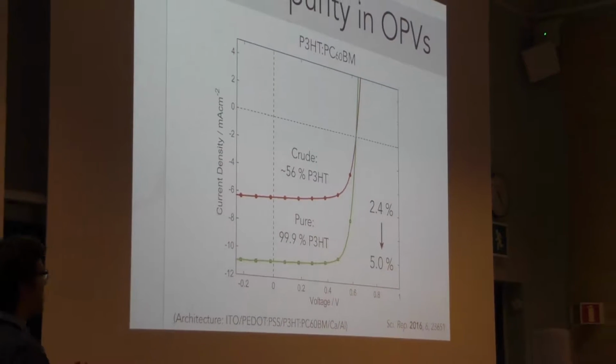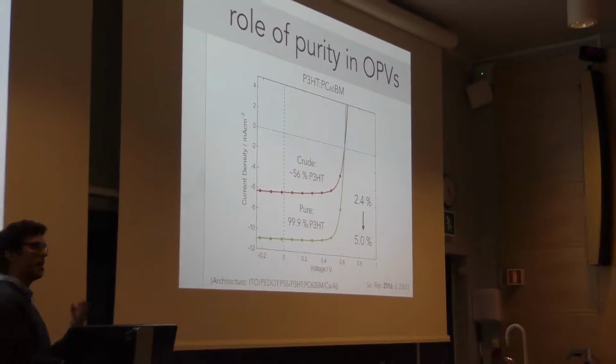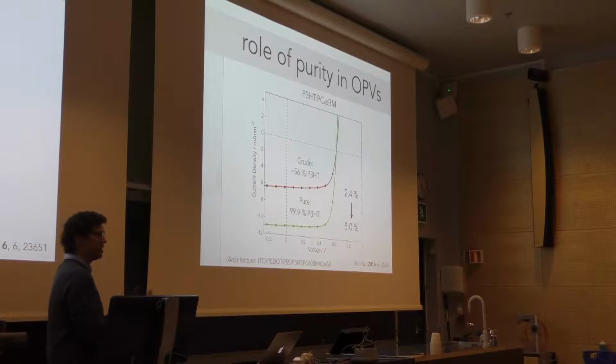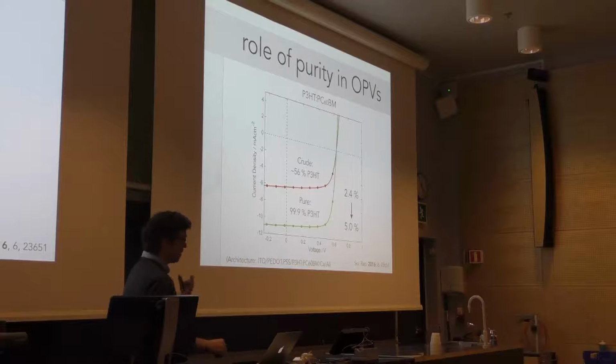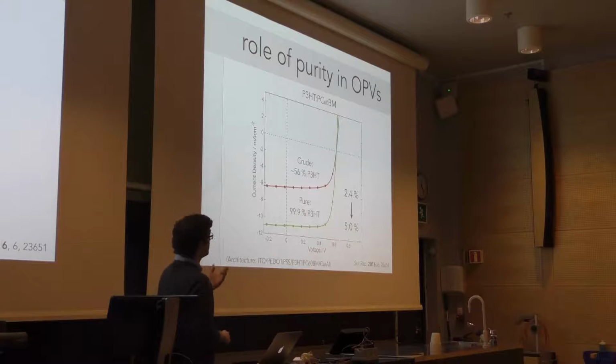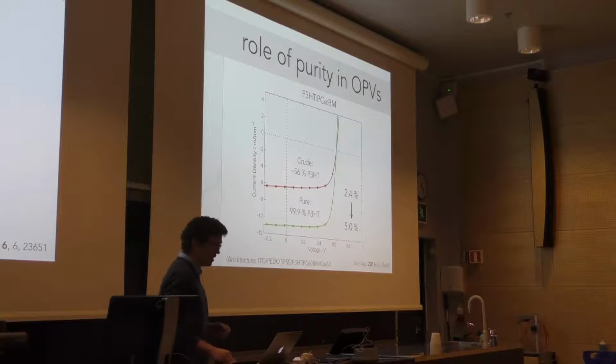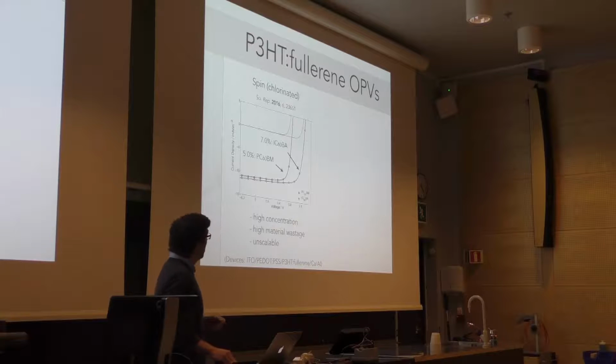So there's a combination of things that are happening here. In flow, we're able to control the molecular weight very precisely for the application, but there are other external factors that still have a very strong influence on the electronic performance, and this is one of the things that we're looking to do in flow, is add the purification step in flow, and that's something that's in development.